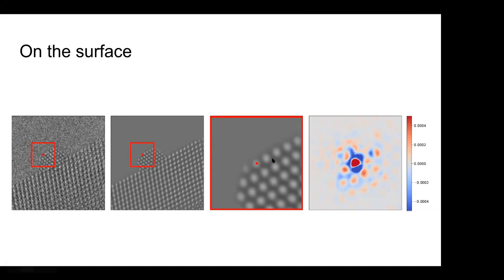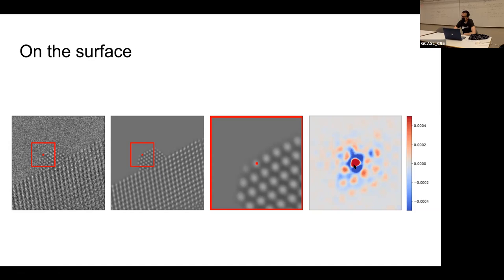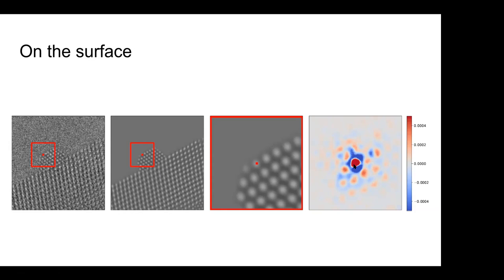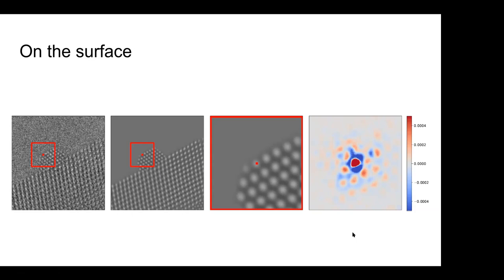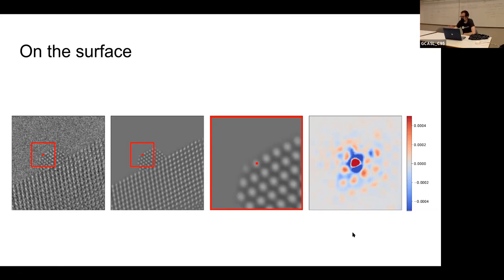I see. These are the partial derivatives. So the output is just one pixel and the input is 10,000 pixels. I see, absolutely. Thanks. These are the partial derivatives of that output pixel with respect to each input pixel. This is a very local linear analysis, but still it's pretty cool that it tells you a little bit of what's going on.